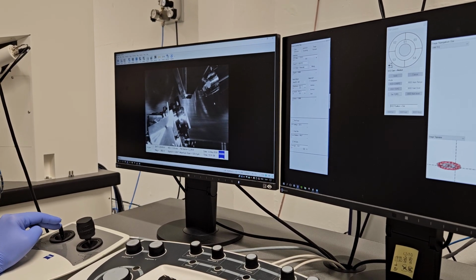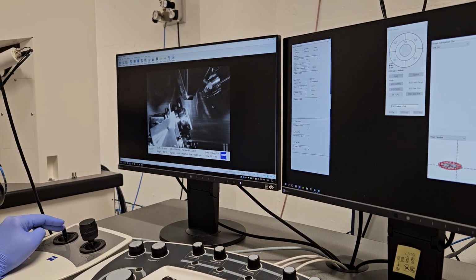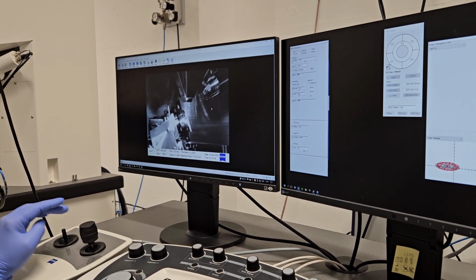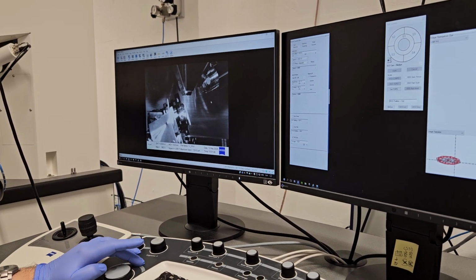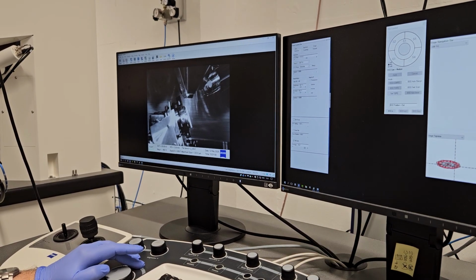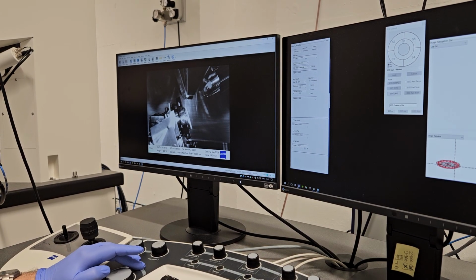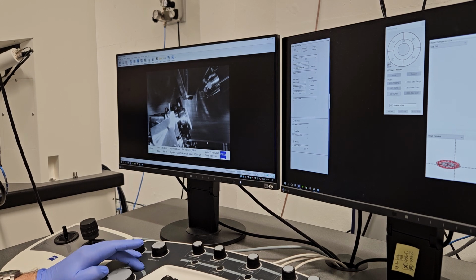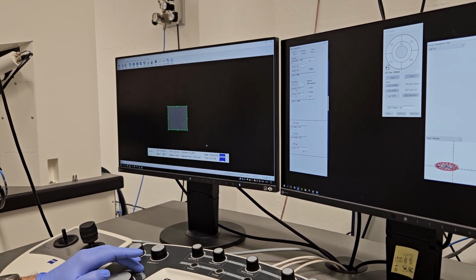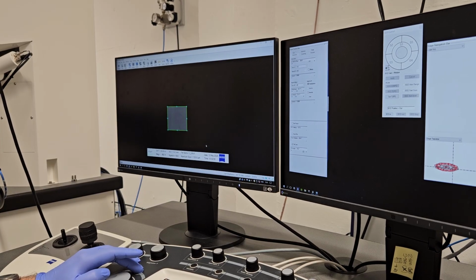You have a sensor, correct? No. You touch, you get fined. Up to this level. No sensor here. The sensor is under for EBSD, but when you move inside, you trust your eyes only.